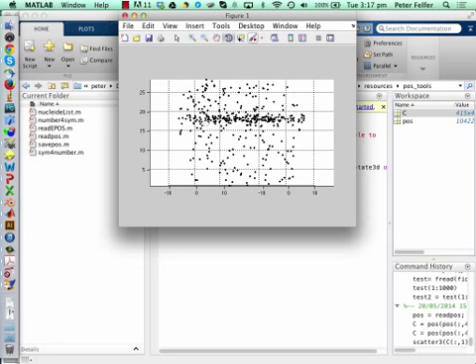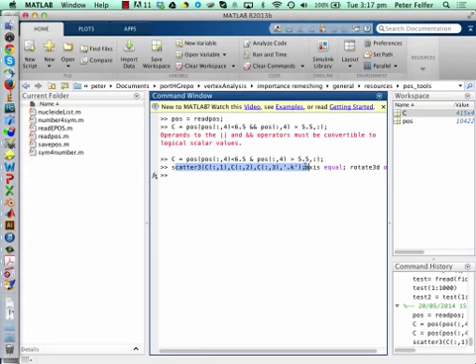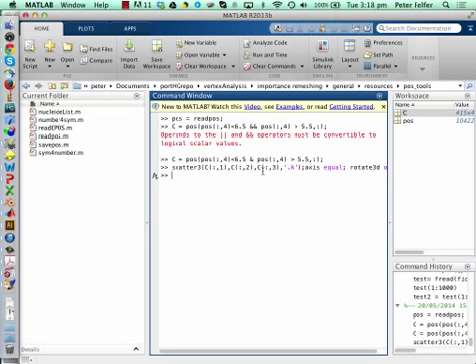Can we please see what the commands are behind that? The commands behind it is just a scatter plot. Yeah, no, the pos equals plus 4. Yeah, but I need to know what the commands are.